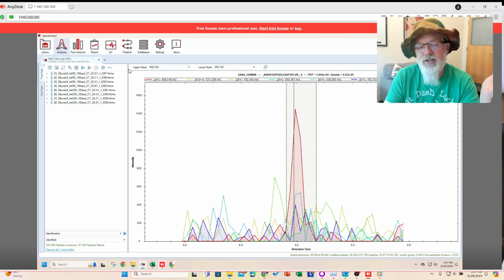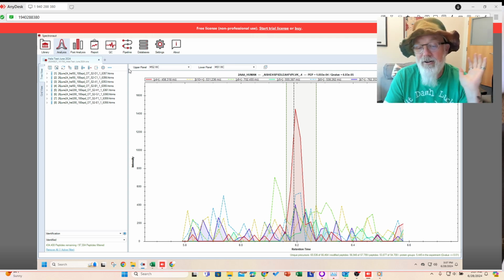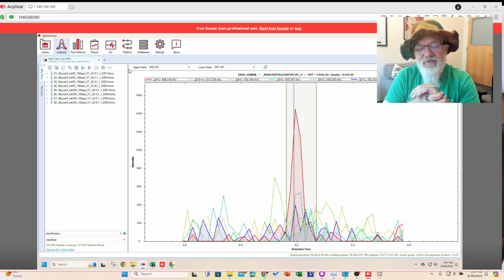And you can see we had some issues when it went up to 4x. Normalization didn't work as well, it wasn't perfect, and nothing is. But anyway, it's good to get an idea of where things start to break down. And I don't even think it broke down. I think it did a really good job for loading 4x the amount of material. So if you accidentally add 4x the amount of material, I think normalization will fix it, or at least try to.